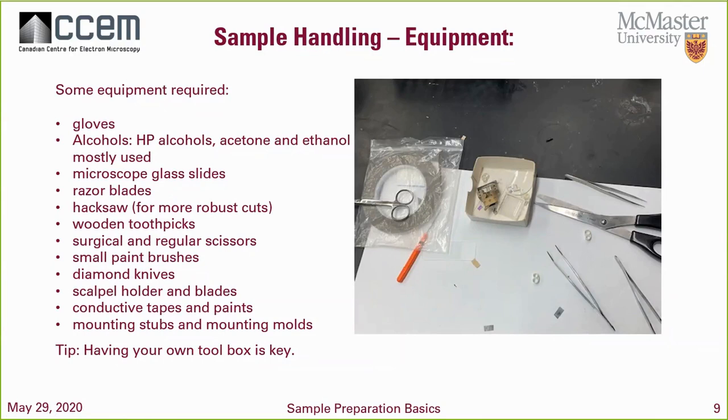Now, it's important that you know that if you are going to use acetone to clean your samples, or put your sample in an ultrasonic bath to clean with acetone, it's important to rinse it afterwards, because the acetone tends to leave a film.